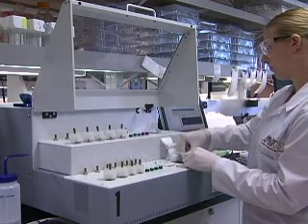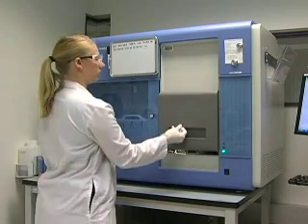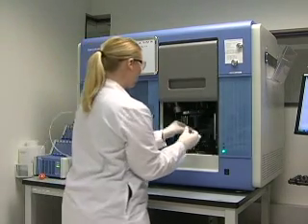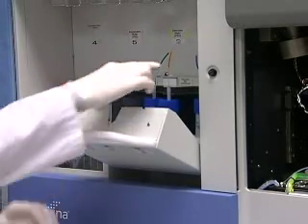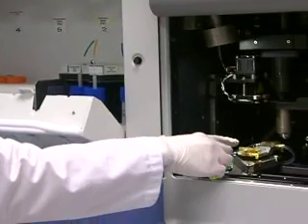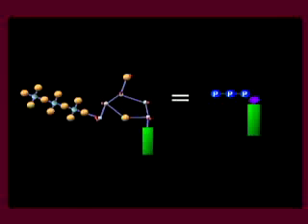The flow cell is removed from the cluster generator. For the next step, the flow cell is loaded into the genome analyzer. This machine also has reservoirs attached to a set of tubes to deliver the reagents needed during sequencing, such as buffers, DNA polymerase, and fluorescently labeled terminator nucleotides. Illumina and Sanger sequencing are alike.